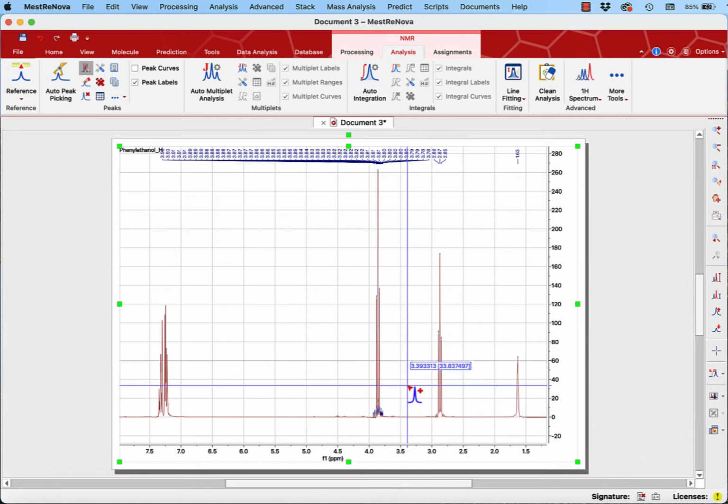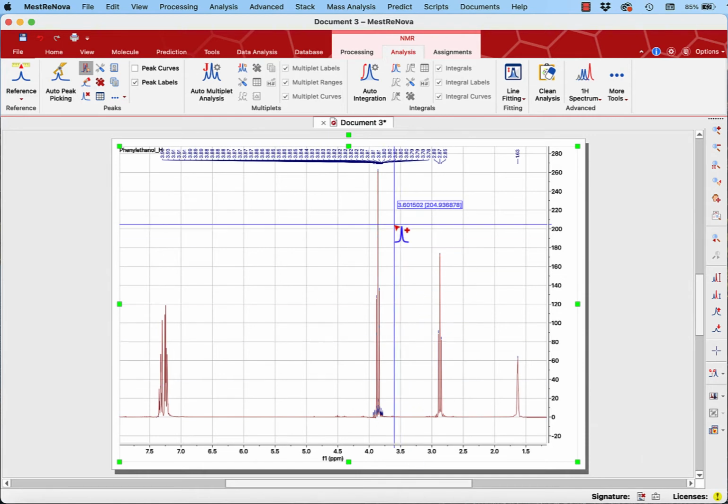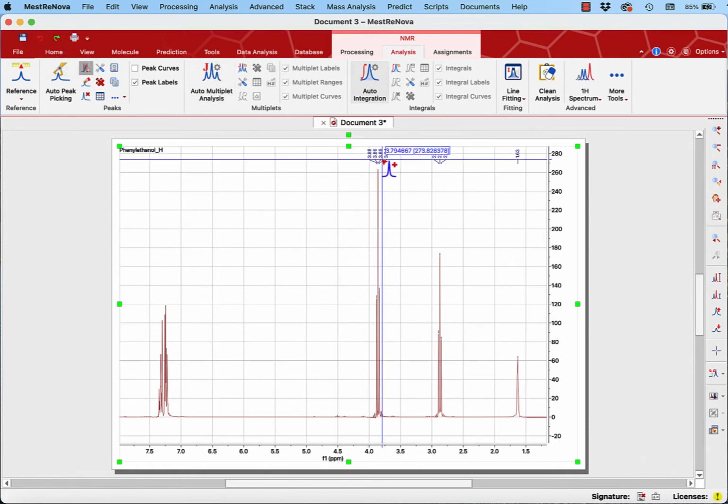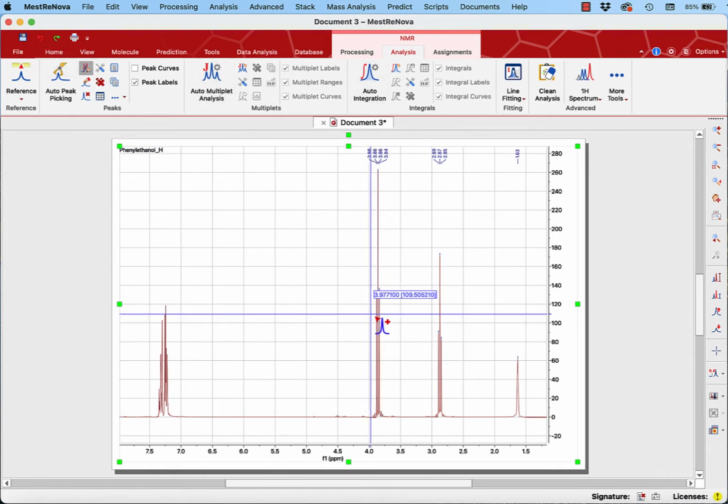Look at all that. So now's actually probably a good time to tell you about the undo button as well. If you make a mistake, up in the top left, there's a little red backwards arrow, undo. Do undo and you'll go back.